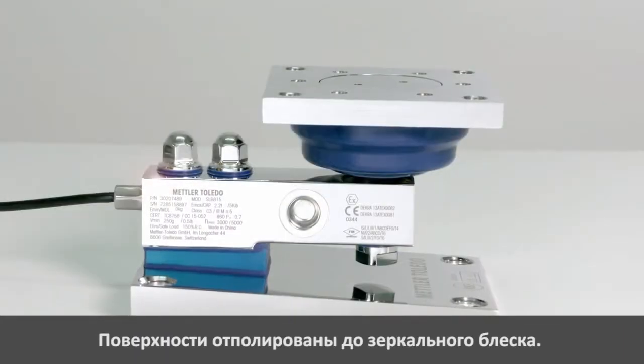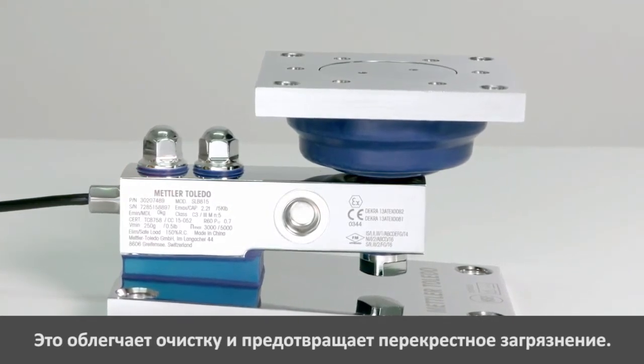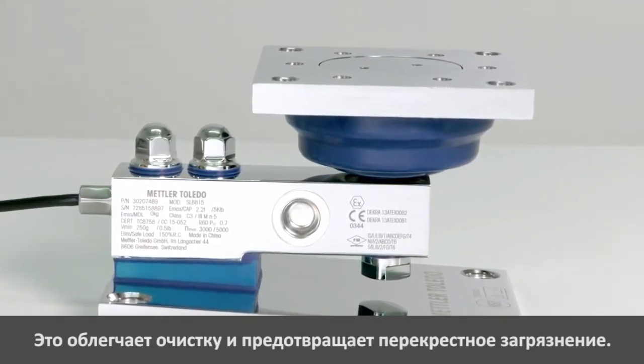The surfaces of the load cell and the entire whey module are mirror polished to enable easy cleaning, fast drying, and to avoid cross-contamination.